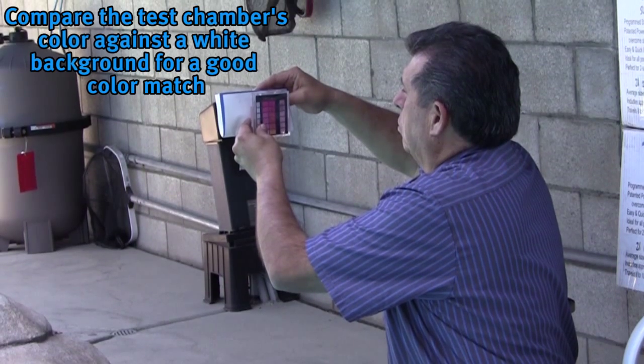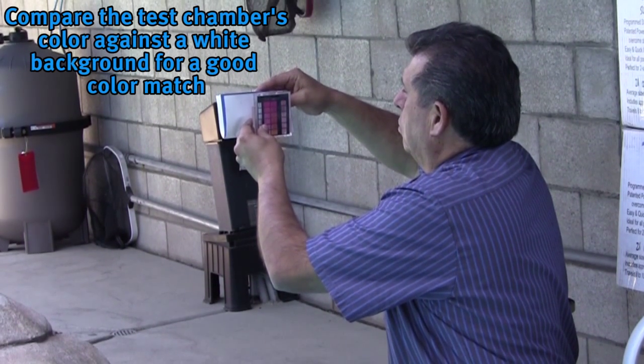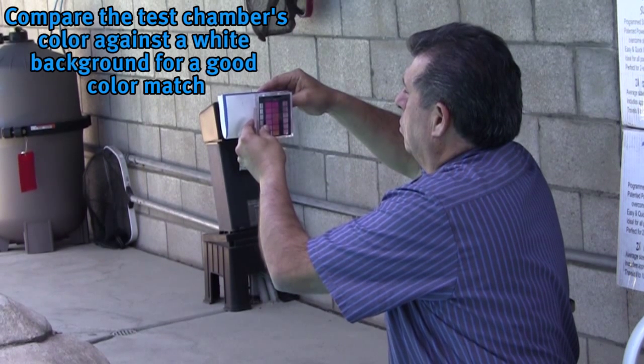After each test compare the color against a white background to ensure a good color match for determining the results.